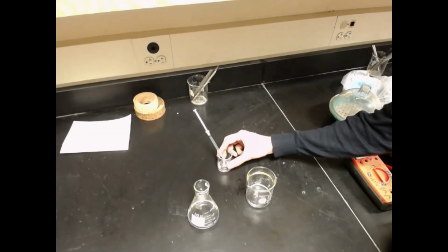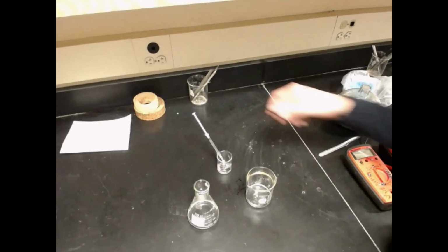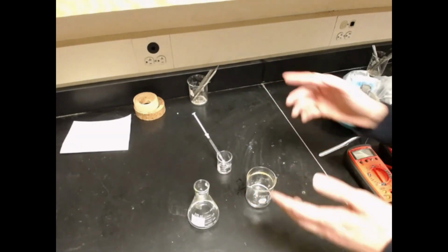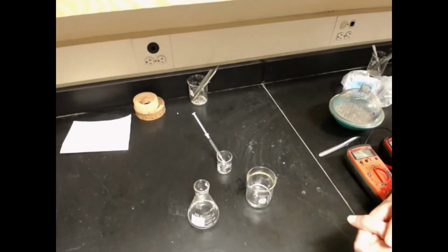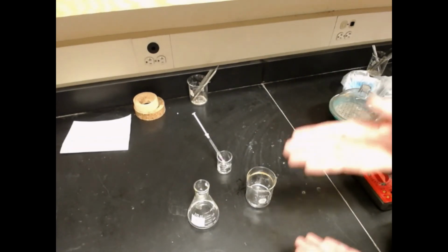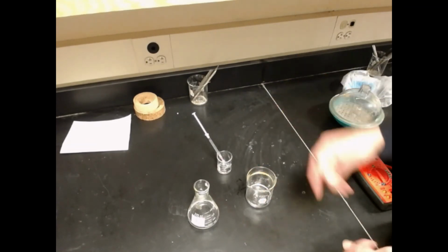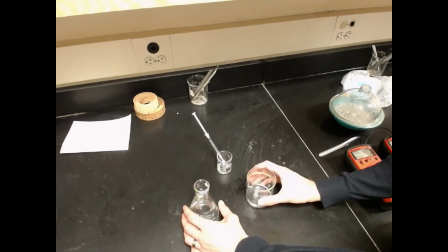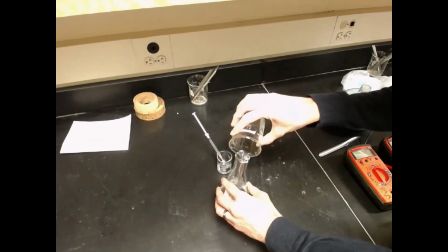Then back here I have a small beaker that has a little bit of thiosulfate in it. When the color appears, I'll add more of this, which will make the color disappear because it'll react with the iodine that's been formed. This is to show you, if you did this in the lab, we would do this multiple times and measure the time difference between each of these. So let's go ahead and mix these together. The reaction should take around a minute or maybe a little bit longer.